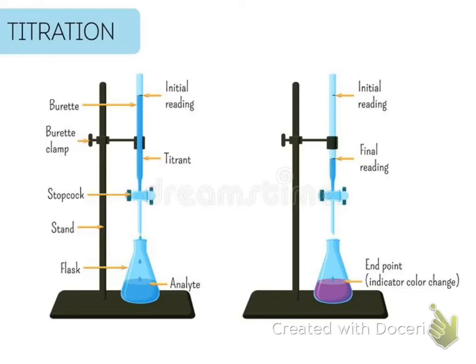So let's talk about titrations a little bit. You should have already seen that video. It's really, really good at showing you this technical lab technique. I'm just going to explain a few things that'll help us as we get into calculating once you've actually recorded the data.